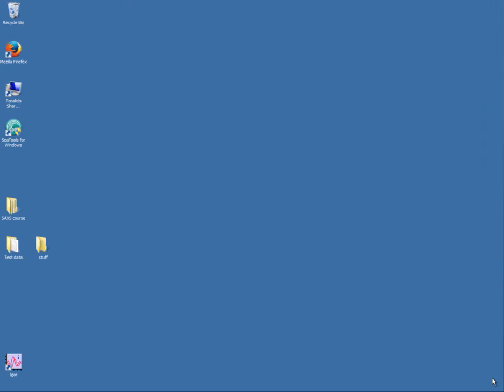Welcome. This movie will show you how to install Irena and Nika packages with a slightly more complicated method than the method I just posted in the YouTube channel. This one is a little bit more complicated because it allows you to download all of the installation files locally on your computer and install it from there.